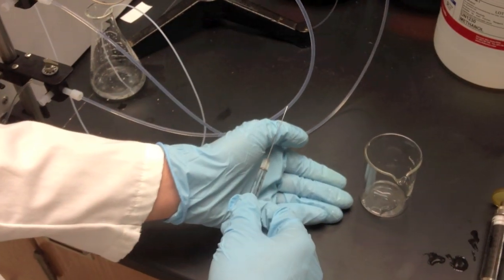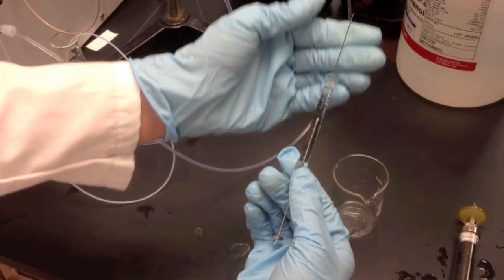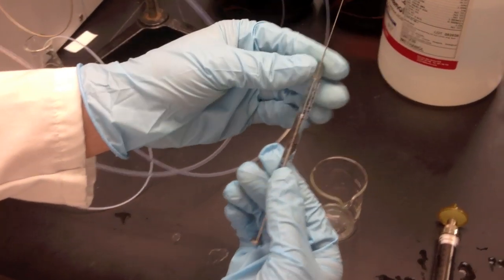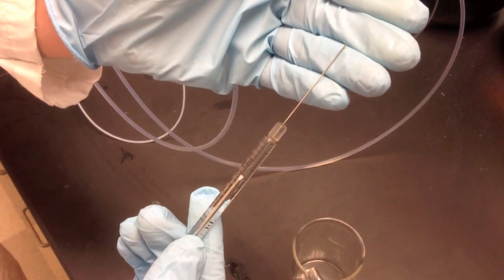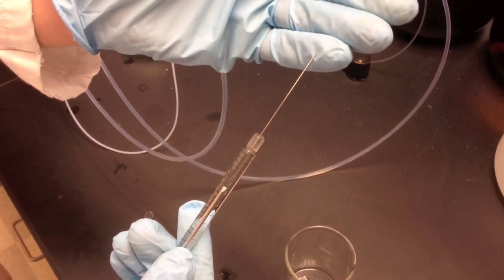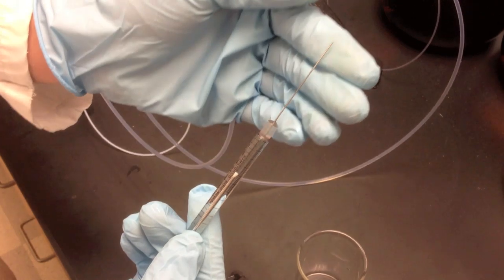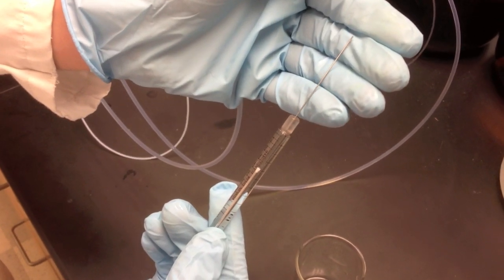So once we have our filtered sample, we're going to draw it up into a blunt syringe, approximately 40 microliters. Make sure it's a blunt syringe and not the GC syringe, which is actually a serrated blade. So while that's all done, we're now going to shoot it onto the machine.